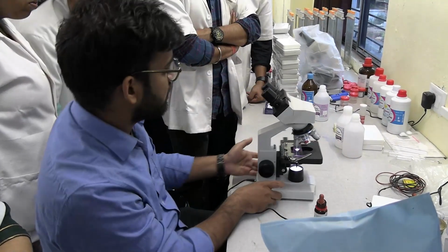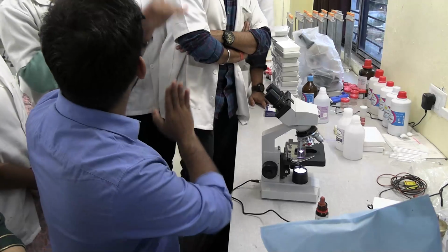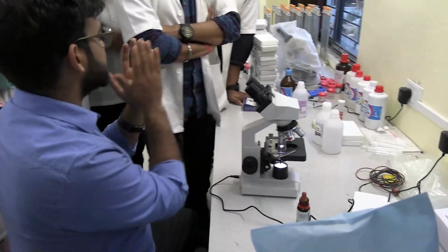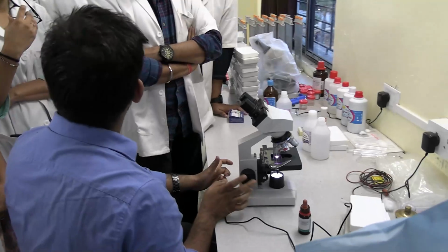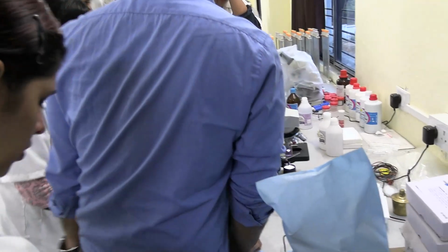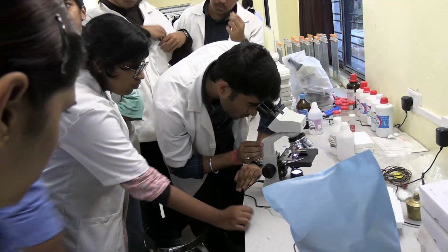What have I done? First I made the oil touch the lens. Slowly when we adjust the coarse adjustment, whenever I see the field, I go to the fine adjustment. Now see, you can see the cells, and you should tell me which type of cell it is.